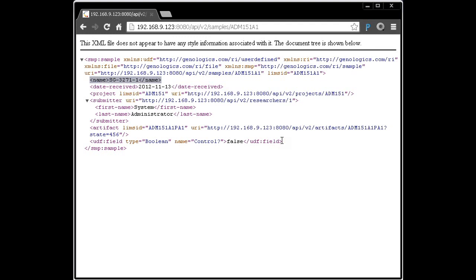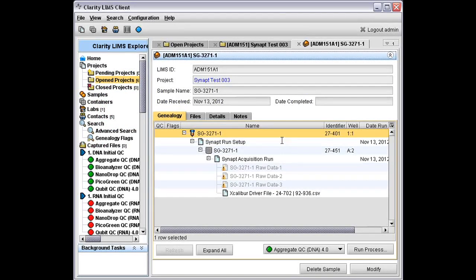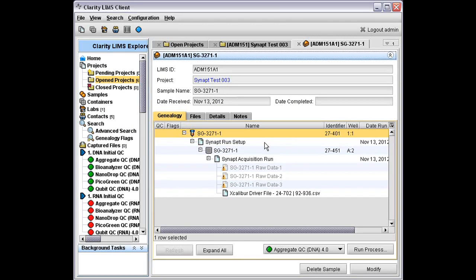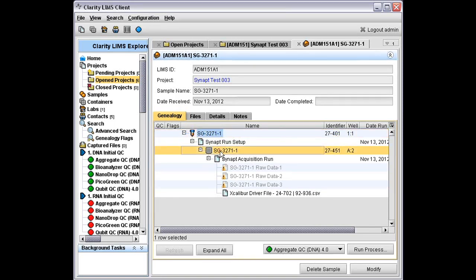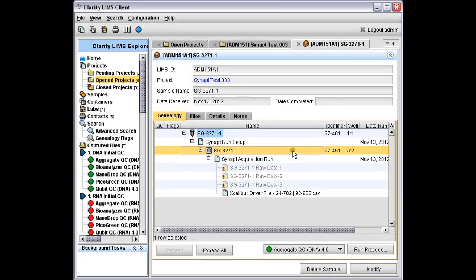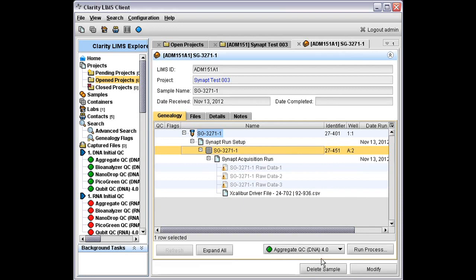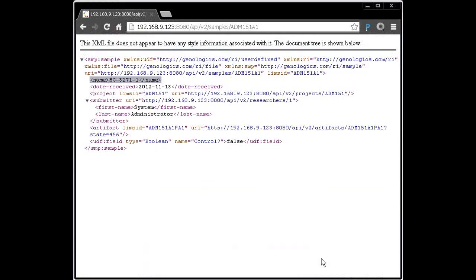We're not just limited to looking at samples. We can look up lots of other things. So let's go and look up an analyte. What's an analyte? It's a sample derived from the initial submitted sample. There's one here which looks like it's located in a plate in position A2. We'll do the same trick. We'll copy its LIMS ID to the clipboard. We'll switch back to the browser.